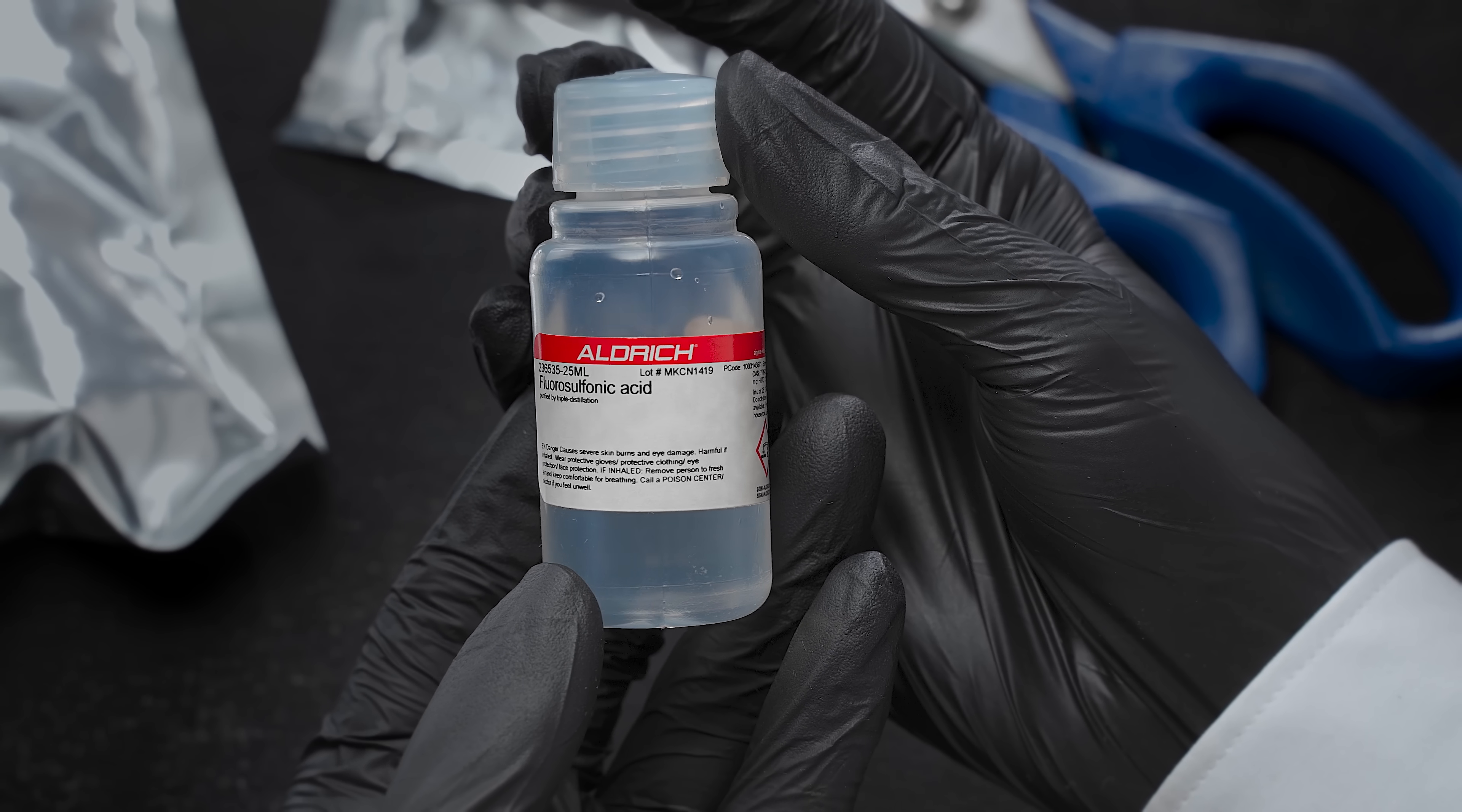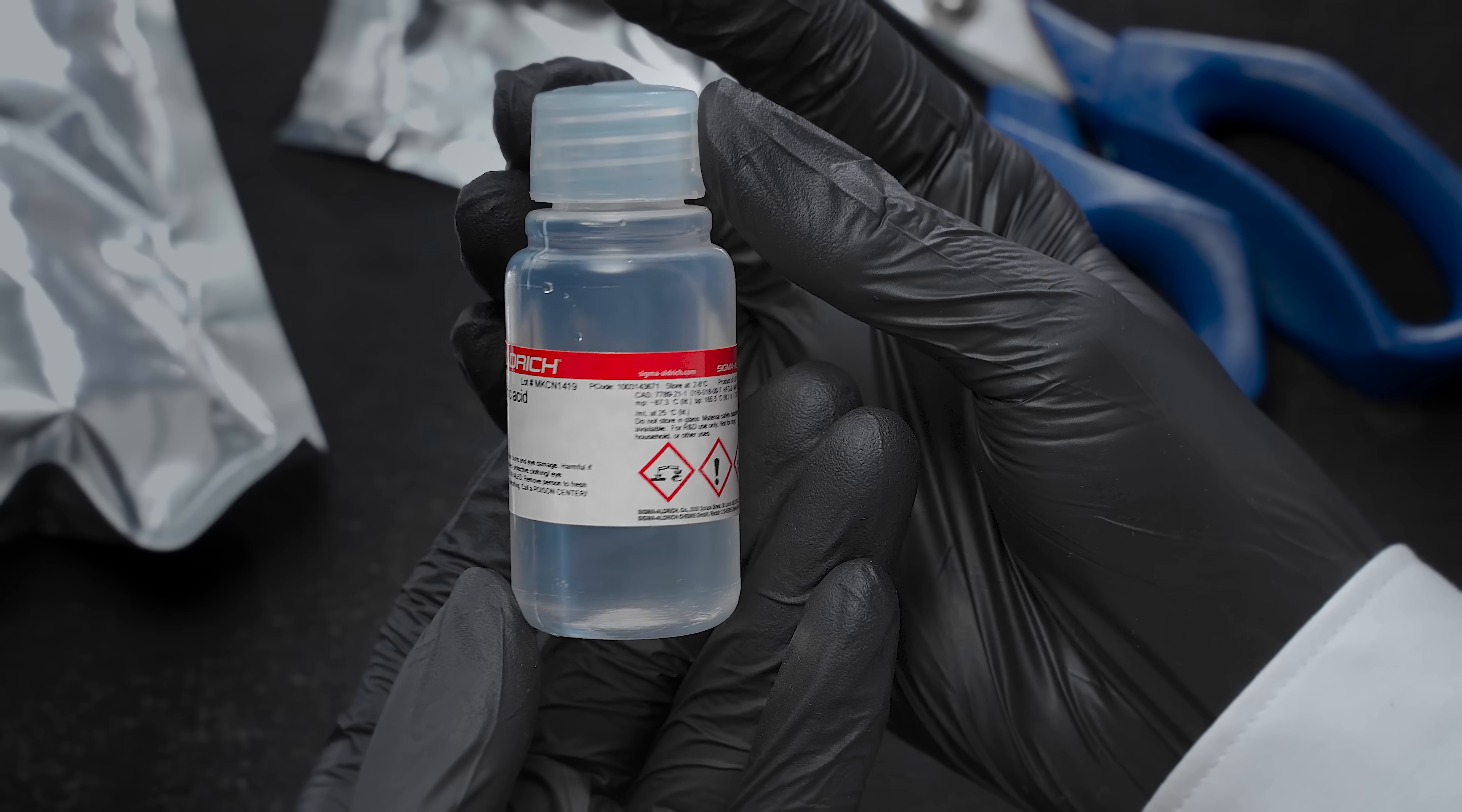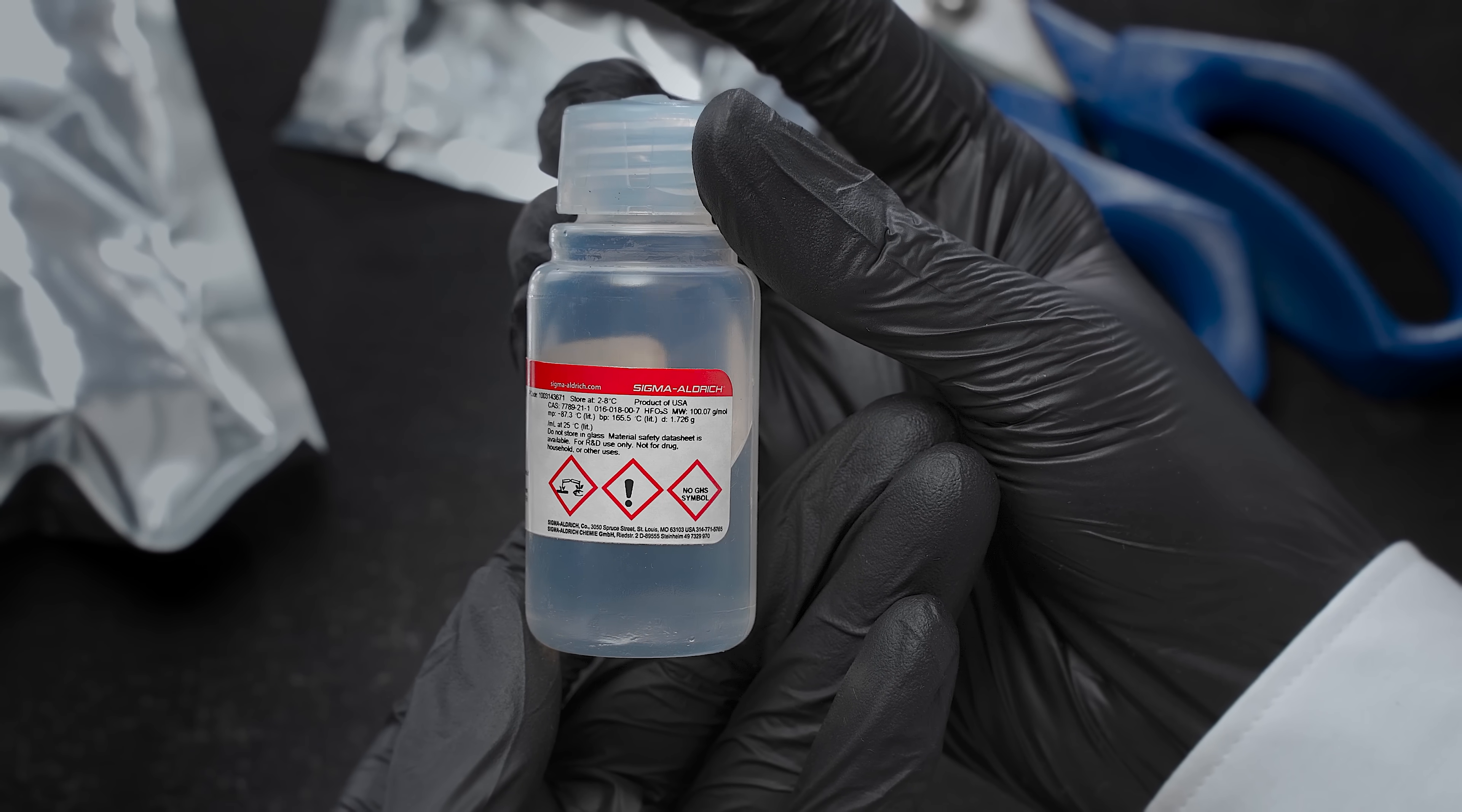Fluorosulfuric acid is a free-flowing colorless fuming liquid, is considered to be highly toxic and extremely corrosive.